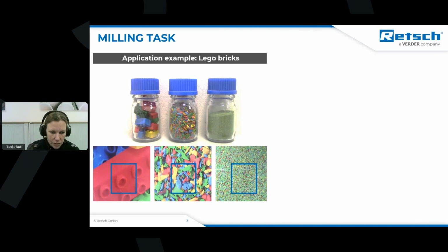So here, in this intermediate state, you see, okay, now I have every color present, so I should see the toxics. Yes, you see them, but is it the right amount? Is it really quantified? And do you really see the true amount of the toxins? Because maybe there's only one yellow part, and this is underrepresented.